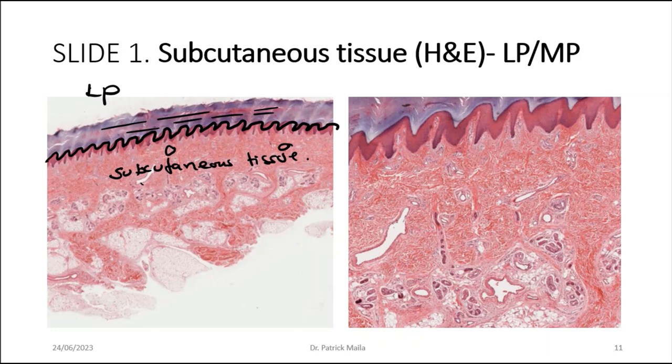There are numerous blood vessels. This is a blood vessel here, and here, and here. Blood vessel here, blood vessel here, blood vessel here, blood vessel here.